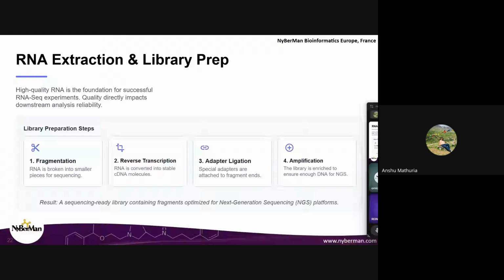From step 1 to step 4, this is just a pre-processing step. Generally, when you analyze data as a bioinformatician, you will start from a FASTQ file. Your lab will produce the data and hand it to you for analysis, and from there you have to move on. So this is just a brief understanding of the initial steps, that is, sequencing. The first step is going to be extraction: how do you extract RNA and how do you do library prep?